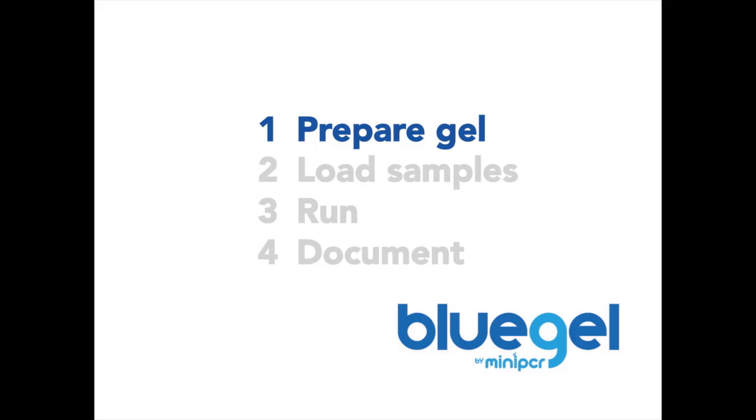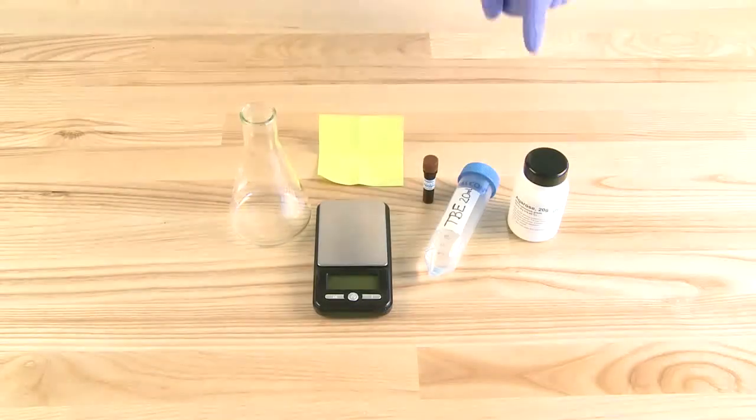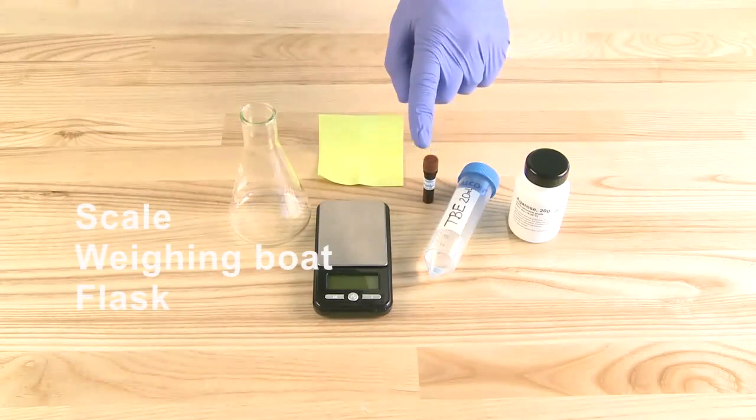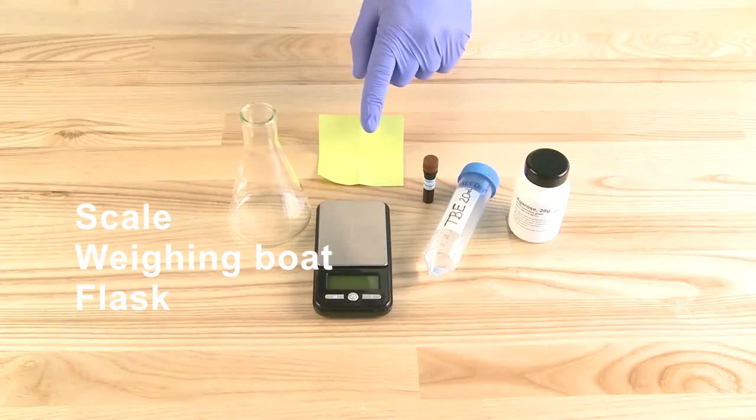Let's get started by preparing a gel. For this step, you will need agarose, running buffer, DNA stain, a scale, a weighing boat, and a flask.